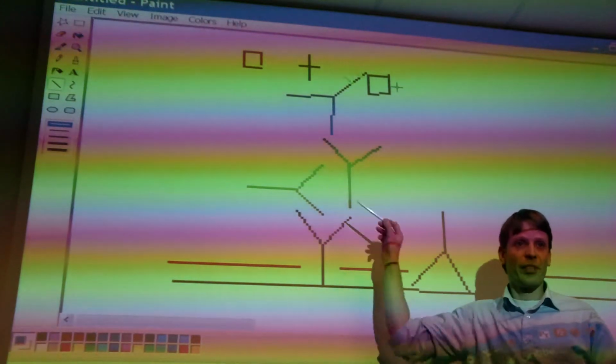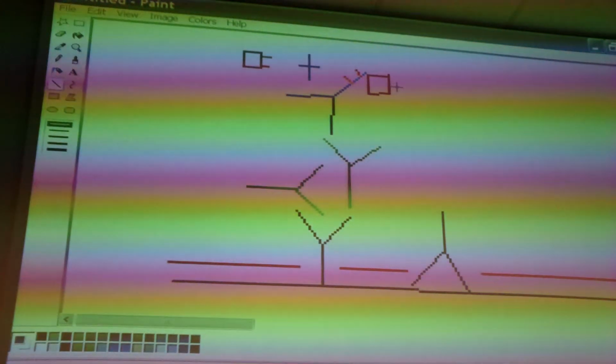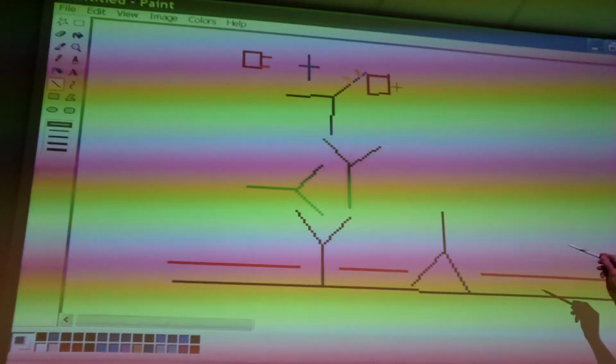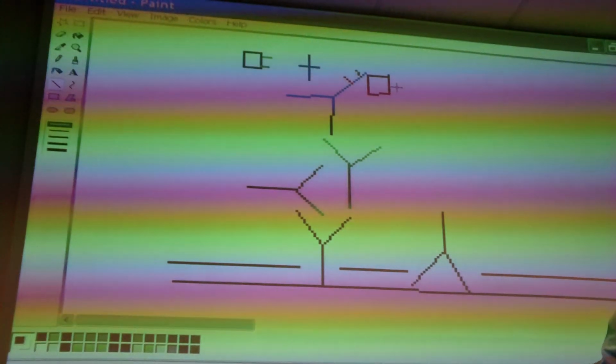So goat anti-human. Why is mouse anti-human a very rare antibody to use in such an experiment? But they're probably very alike. No, they're not. That's not the reason. Goat and mouse are actually equally dissimilar. The question was, what is going to be the source of your antibody? You need a lot of it, so you have to use 100 mice or one goat. Exactly, that's the point. Mouse is too small to get enough antibody out.